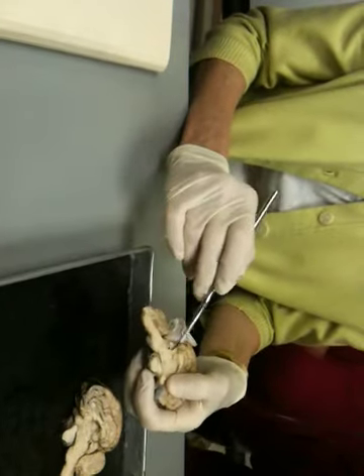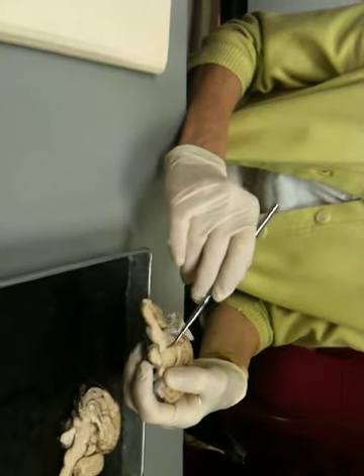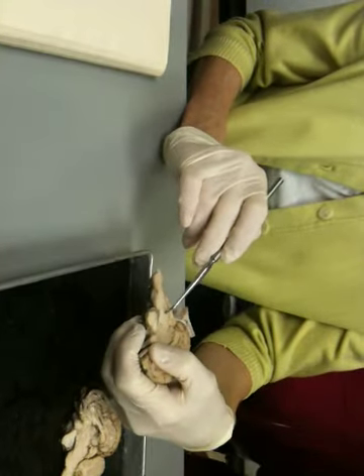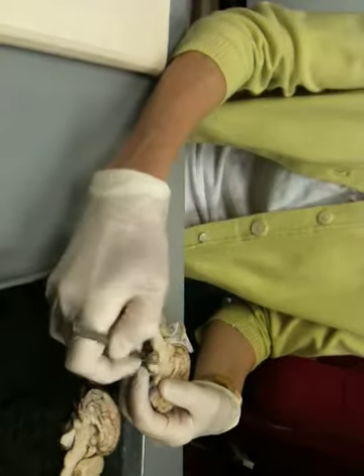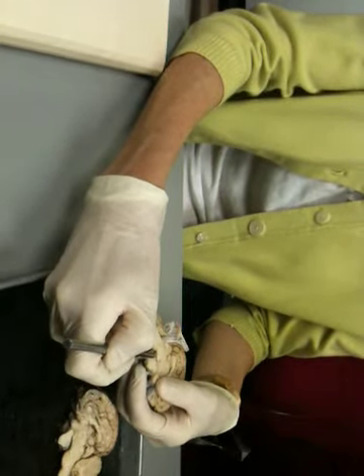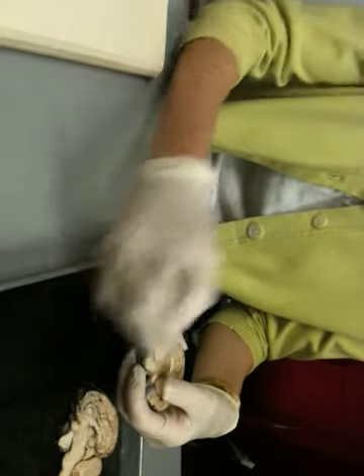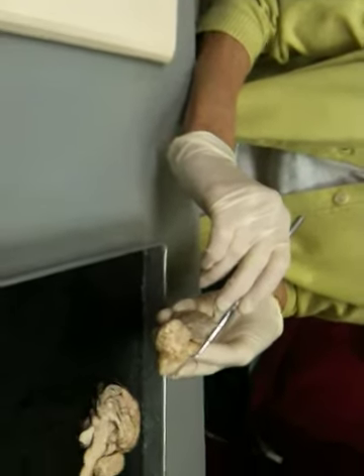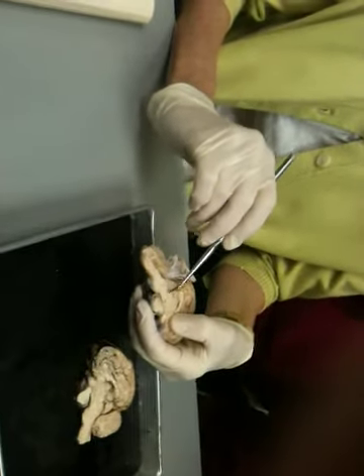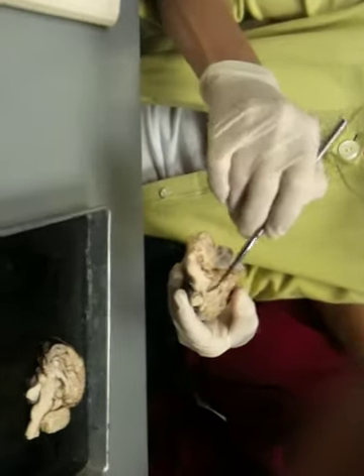Below that, now remember that this whole area is the mesencephalon, or midbrain. This part of it is the cerebral peduncle. This is not labeled on your photograph of your sheep brain. They're pointing here, and the label that's here says midbrain, but this whole thing is the midbrain. This is a cerebral peduncle. Towards the lateral, it's more inferior in the sheep. In humans, it's the more anterior part of the midbrain.